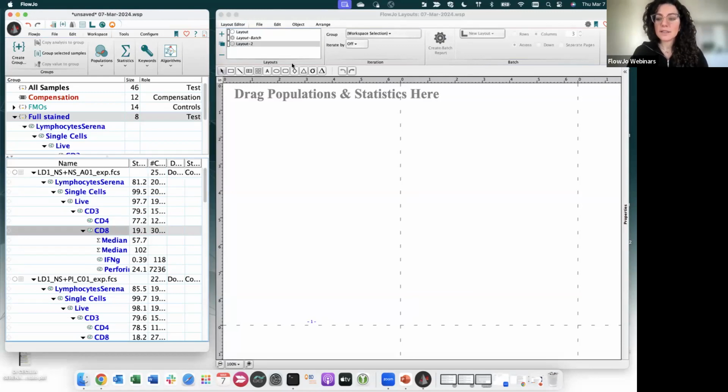Okay, I see another nice question, which is how can I save the analysis as a protocol? I will cover that in a second. Let me show you just the histogram overlays. And this is true for any overlay.